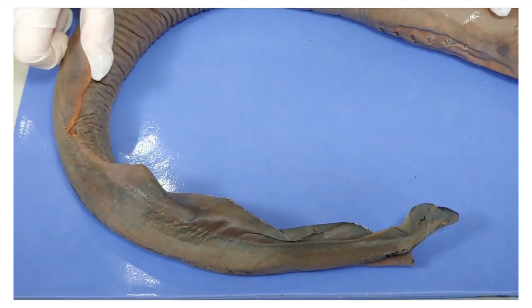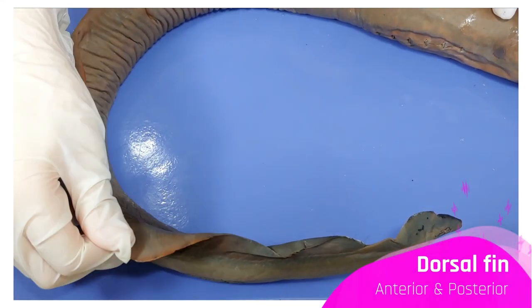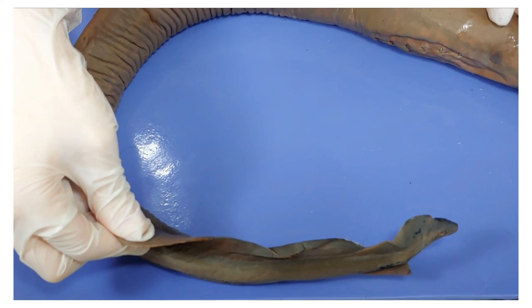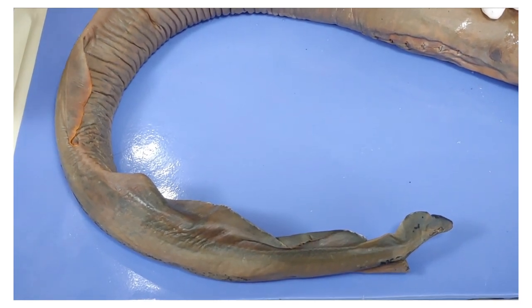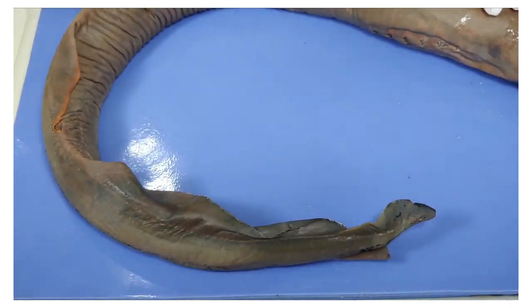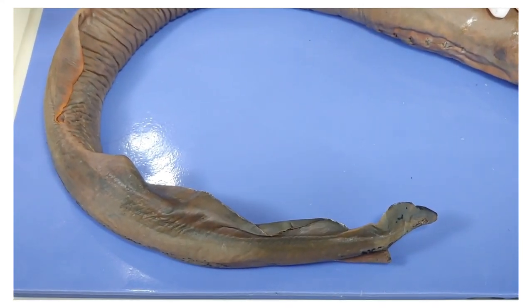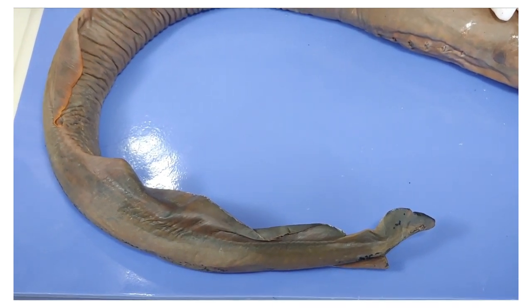A lamprey has a single fin running down its back, and it's not paired like we saw in bony fish. This is the dorsal fin, and it has two parts: the anterior and the posterior part. Later, fish like the perch evolved paired fins for more maneuverability. Lampreys move kind of like a snake through the water. This caudal fin here propels them forward. Now, if you think that would look stupid, you're right — but lampreys are also apparently among the ocean's most efficient swimmers, so maybe looking stupid is the way to go.